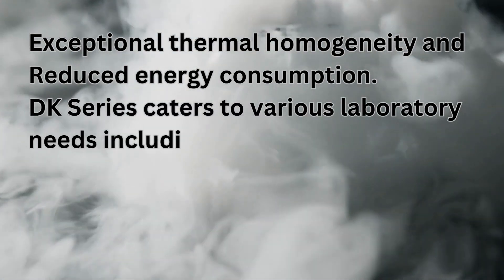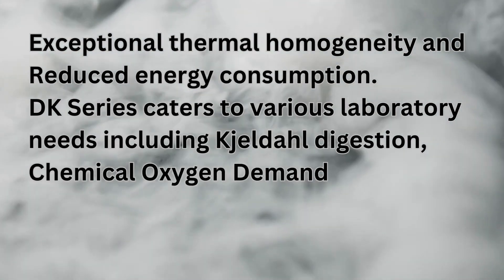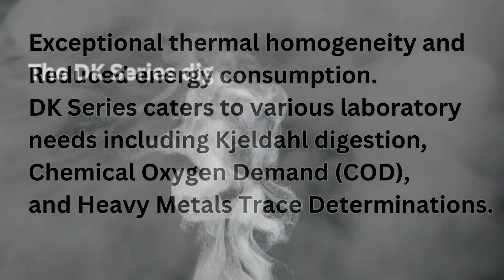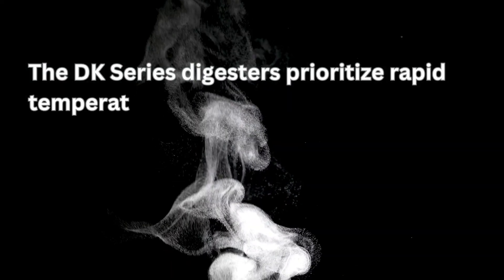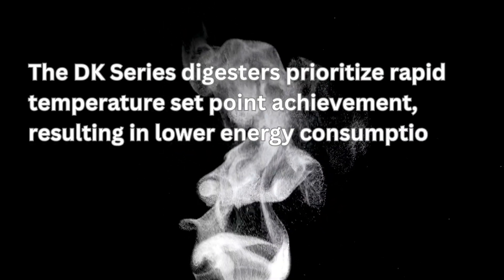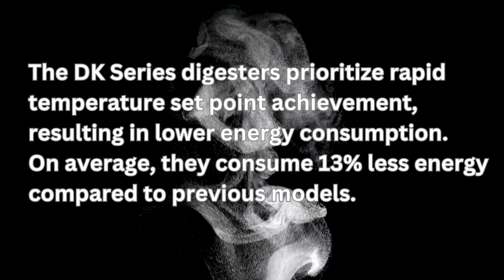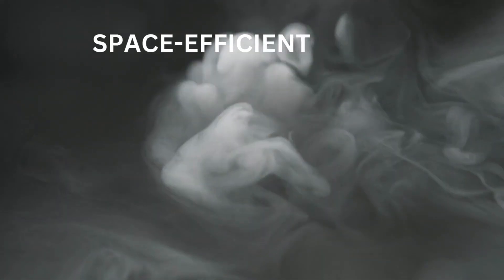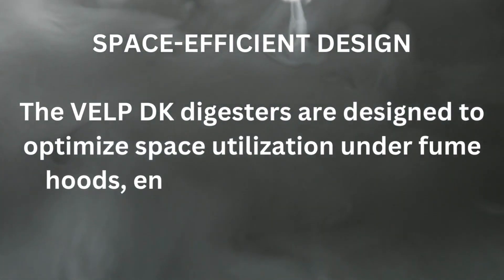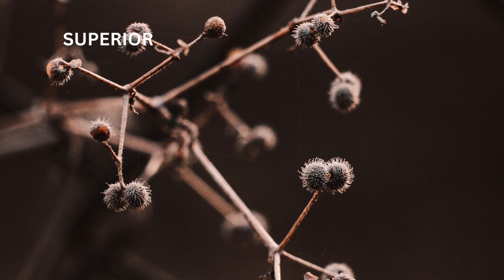The DK series caters to various laboratory needs, including Kjeldahl digestion, chemical oxygen demand, and heavy metals trace determinations. The DK series digesters prioritize rapid temperature set point achievement, resulting in lower energy consumption. On average, they consume 13% less energy compared to previous models. The VELP DK series digesters are designed to optimize space utilization under fume hoods, ensuring minimal footprint requirements.